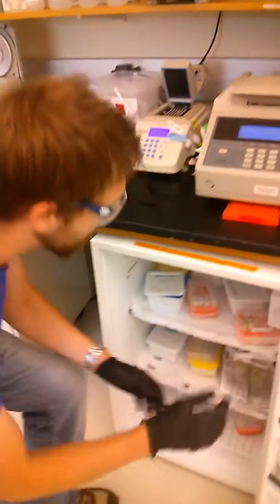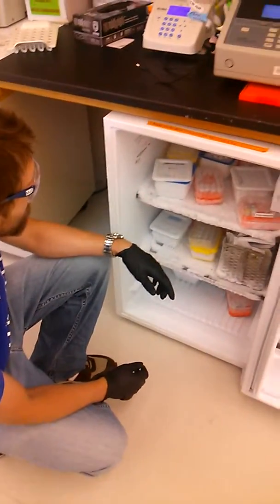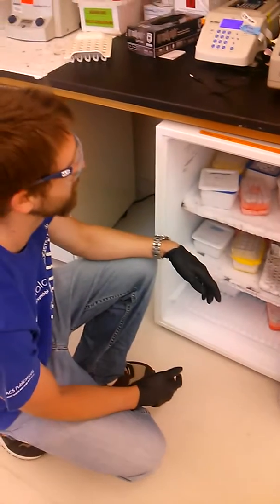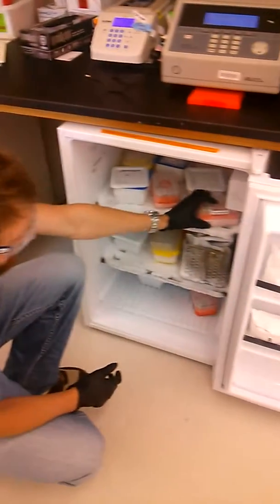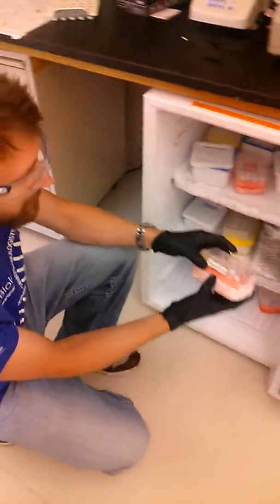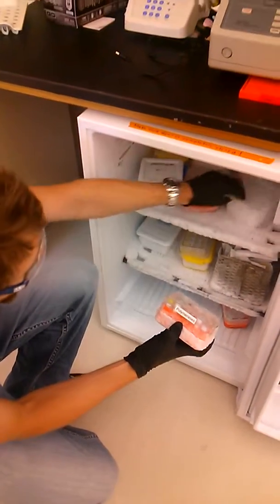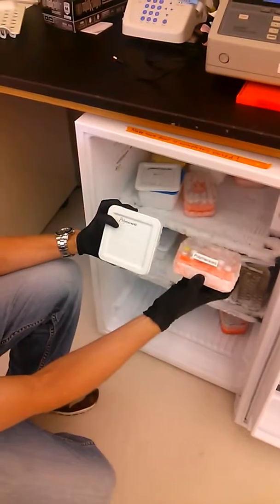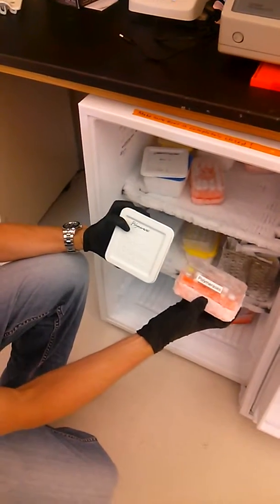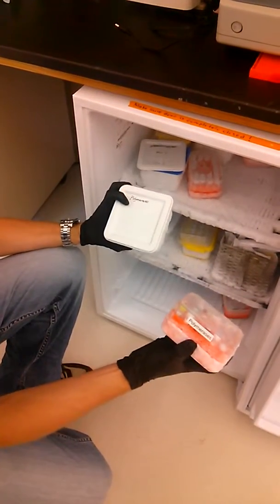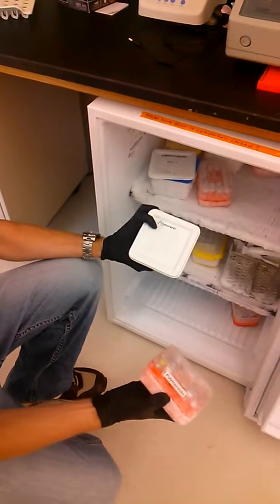Also in this freezer we have supplies for doing restriction enzyme digests for ligations, for cloning. But also we have our polymerases, which are the enzymes that we need to use to run our reaction. So there's actually a couple of different boxes labeled polymerase. And you might use different polymerases depending on what type of PCR you're running.